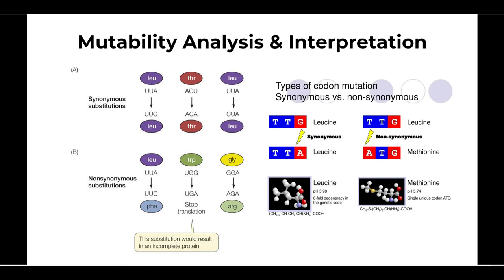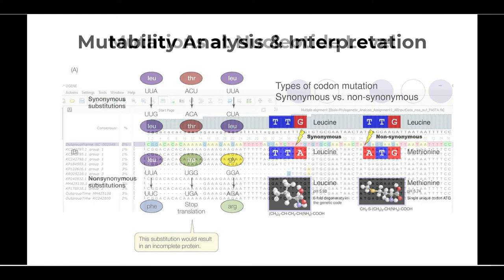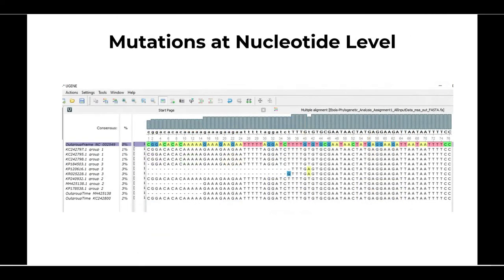The mutability module generates a table in which each genomic position or nucleotide is assigned the most probable nucleotide variant. The variant is assigned based on the maximum of the low thresholds of confidence intervals, transformed to quasi-normal distribution for each alternative in the given position.